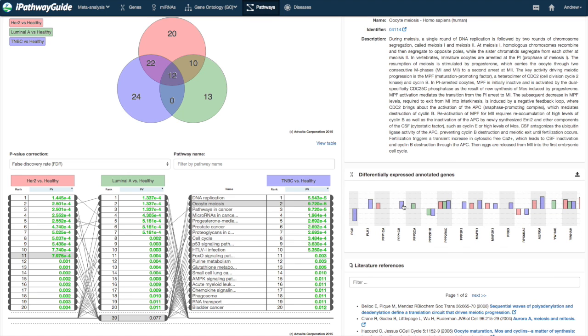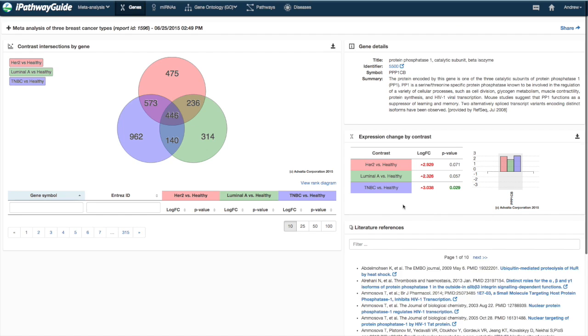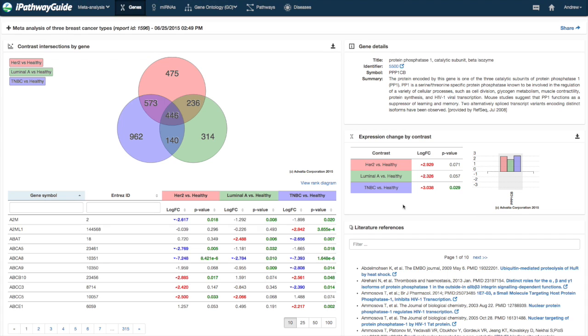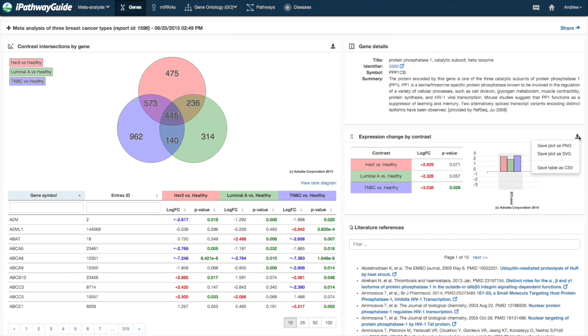Clicking on the bars in the DE plot will bring up that specific gene with additional information. As with all other pages, the plots and tables may be exported by clicking the download arrow. More information is available at www.advitabio.com.